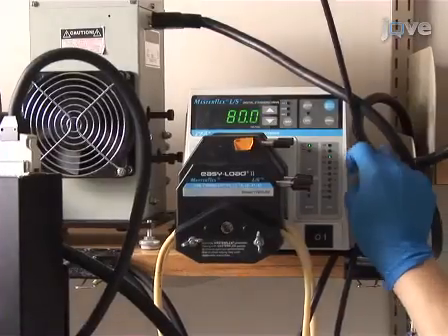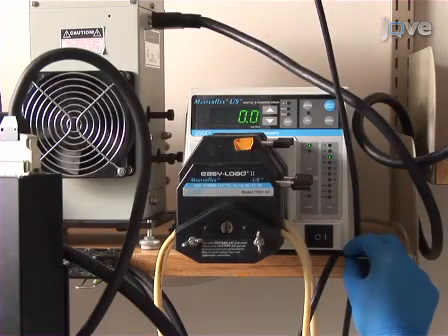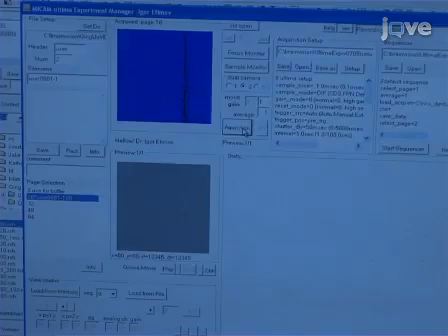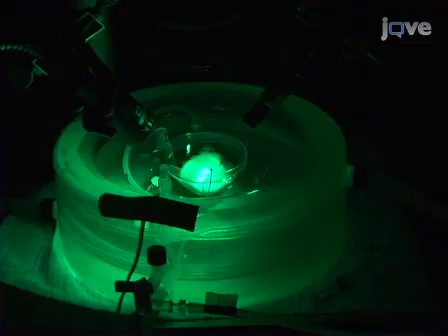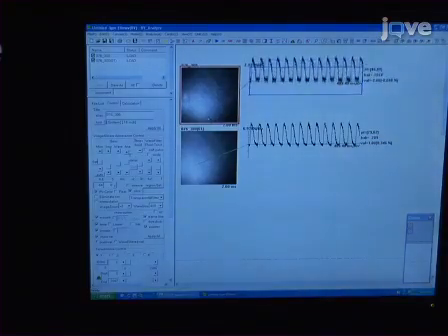Now make a test recording. Turn off the superfusion pump to avoid motion at the surface of the solution. Turn on the halogen lamps and take an optical recording from both cameras. Then turn off the excitation light, turn on the superfusion pump, and check the quality of the optical signals.